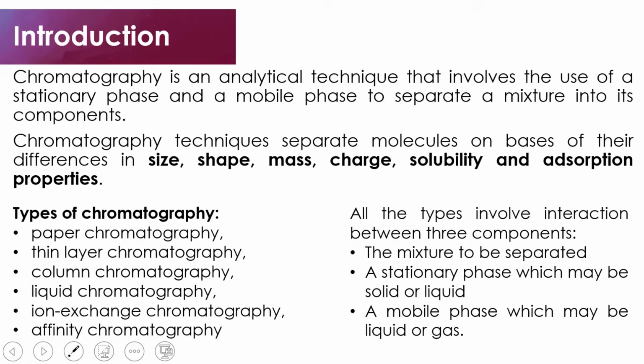And this technique separates molecules on the basis of their differences in size, shape, mass, charge, solubility, and adsorption properties. The types of chromatography: we have paper chromatography, thin layer chromatography, column chromatography, liquid chromatography, ion exchange chromatography, and affinity chromatography.